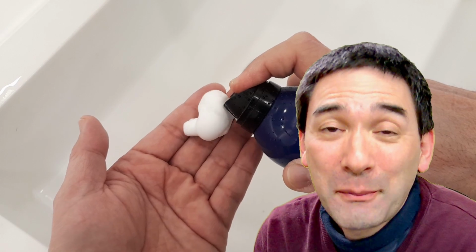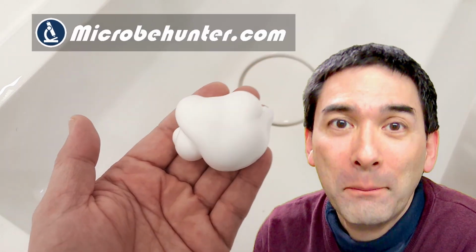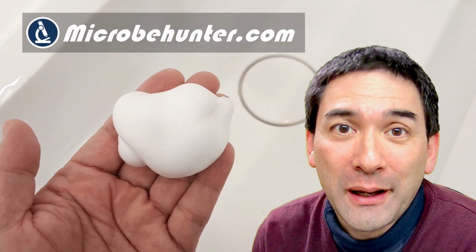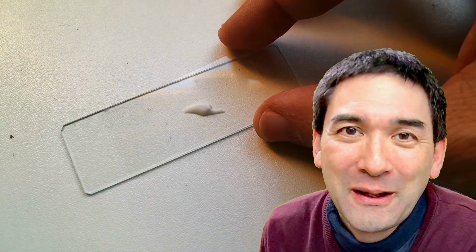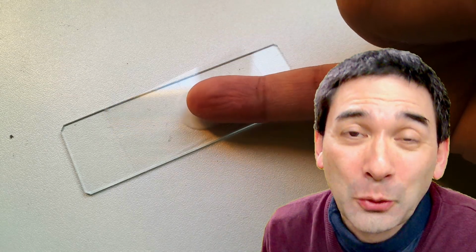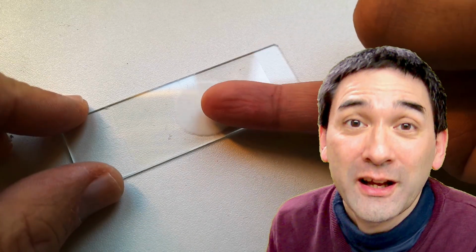So hi, hello and welcome, Microbehunter here, and today I'll put something slightly unusual under the microscope: some shaving foam, because I would like to find out how many foam bubbles there are every time I shave myself. How many tiny foam bubbles are there? Today we therefore have to measure the size of a foam bubble under the microscope and do a little bit of math. Don't worry, I'll spare you the math part, and then I'm able to figure out the total number of foam bubbles that I put on my face every day when I shave.